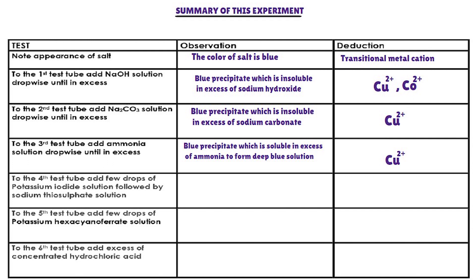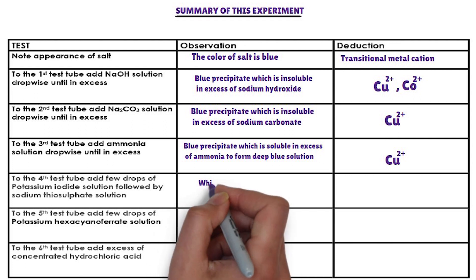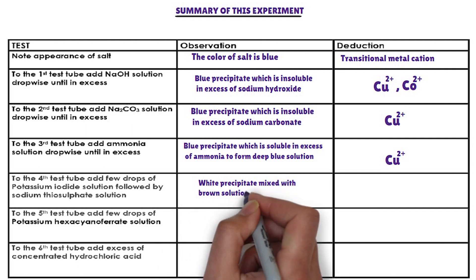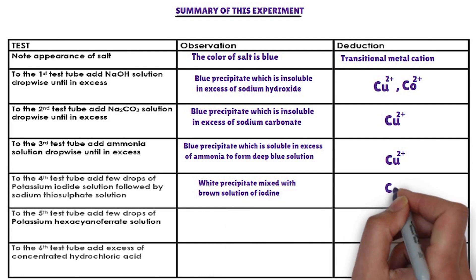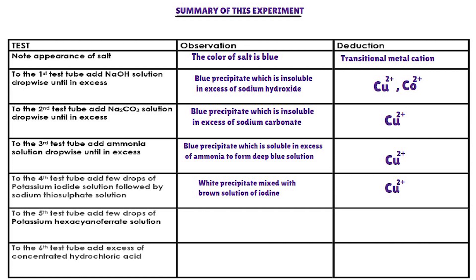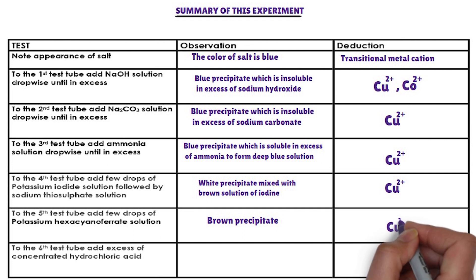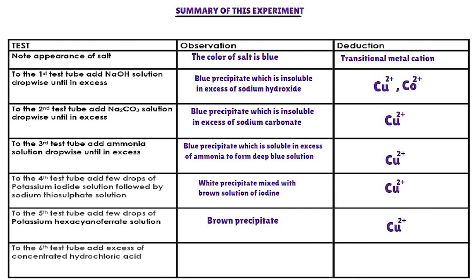Second confirmatory test: potassium iodide solution is added to the fourth test tube followed by sodium thiosulfate. The cation that forms a white precipitate mixed with a brown solution of iodine when potassium iodide is added is copper-2-ion. Copper-2-ion is confirmed. Third confirmatory test: potassium hexacyanoferrate solution is added to the fifth test tube. The cation that forms a brown precipitate with potassium hexacyanoferrate is copper-2-ion. Copper-2-ion is confirmed.